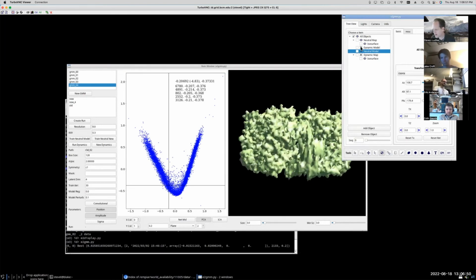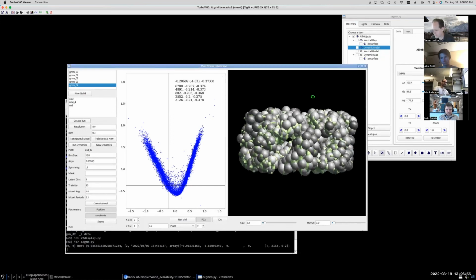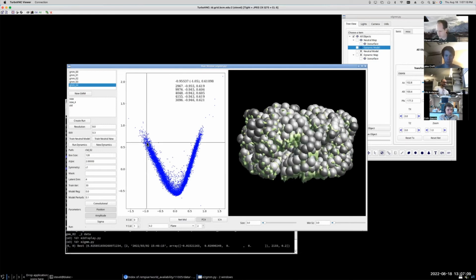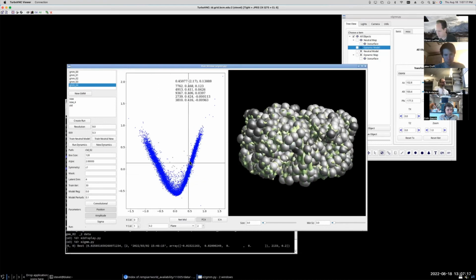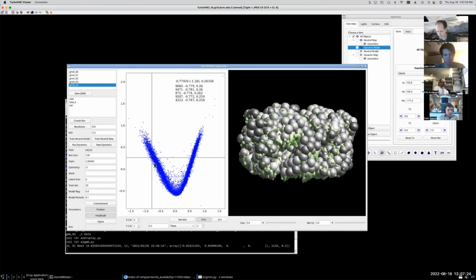And then if we turn on the dynamic model, these are the coordinates of the Gaussians for some particular configuration. Any point in this space, in the four-dimensional space, can represent some configuration of Gaussians. So if I put my mouse here and then I drag, you can see the Gaussians representing that subunit moving up and down. So that's what we should have seen in our little test experiment today.